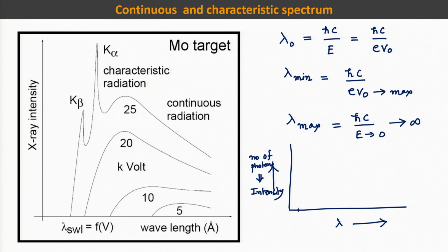So, you have a series of wavelengths for the photons for a particular material, and at the maximum lambda value you will have infinity. So, your graph will look something like this. And this is called continuous X-ray.